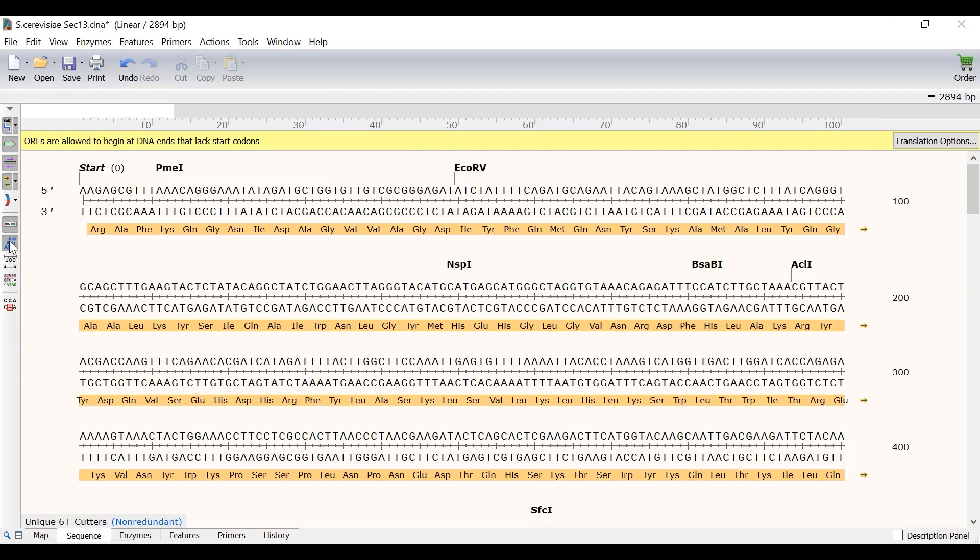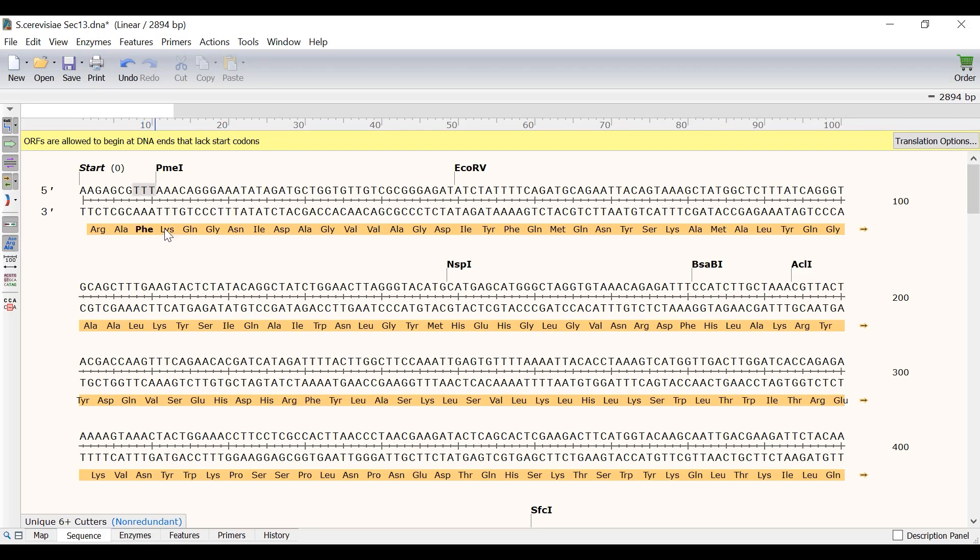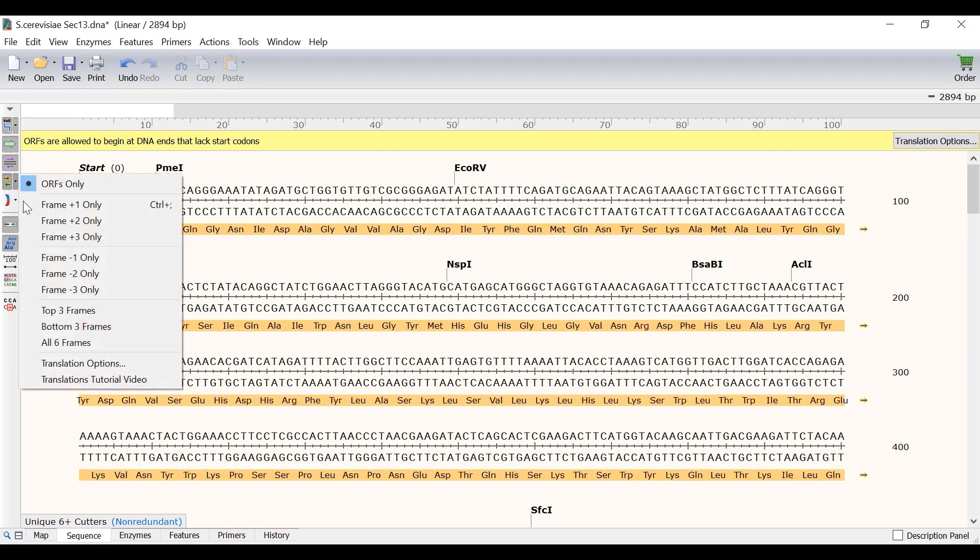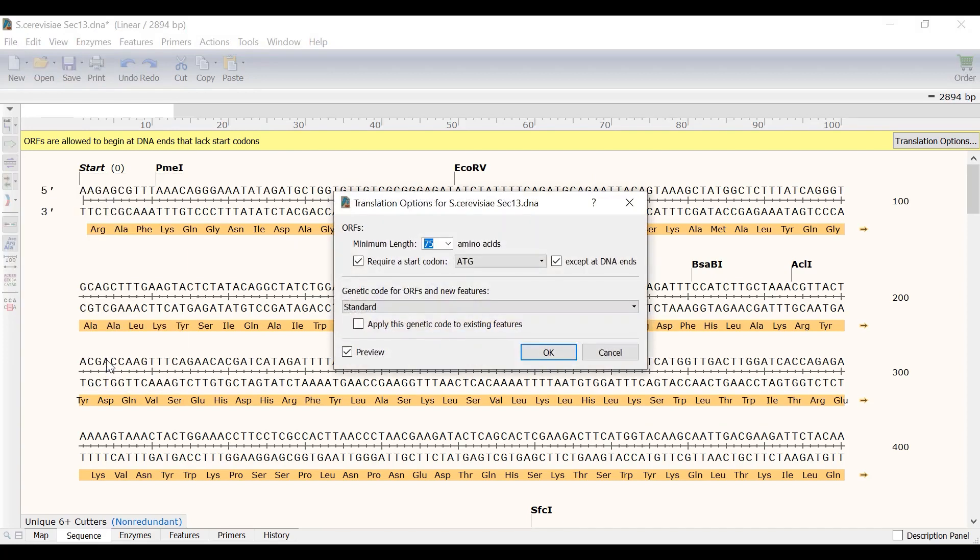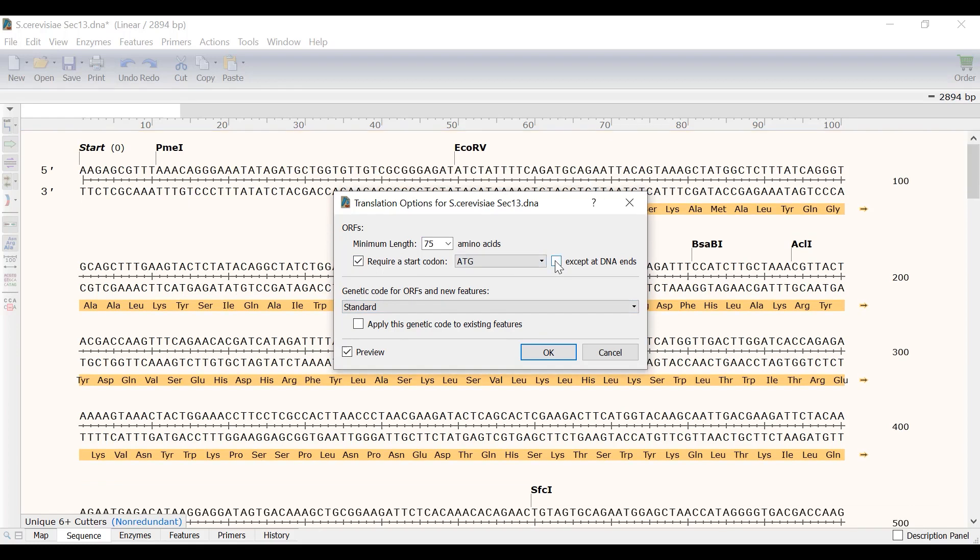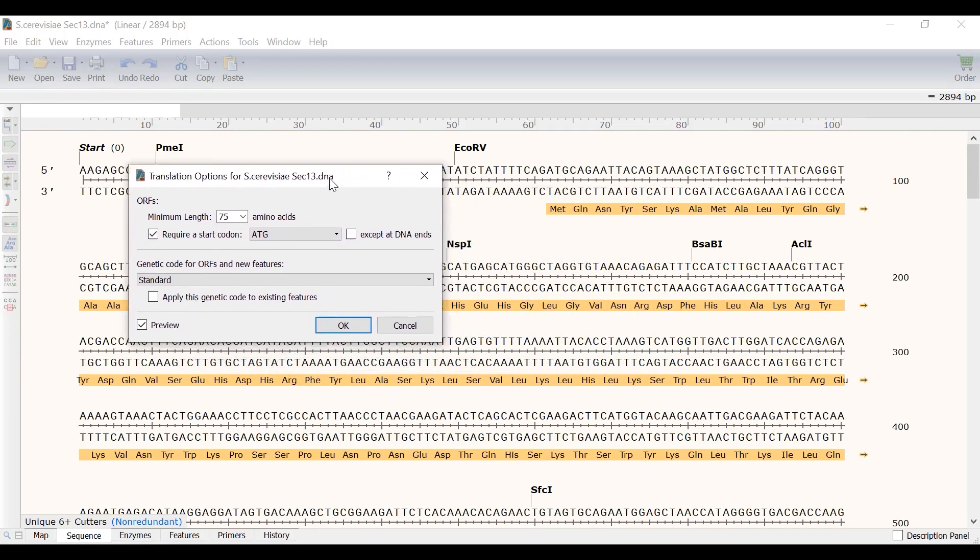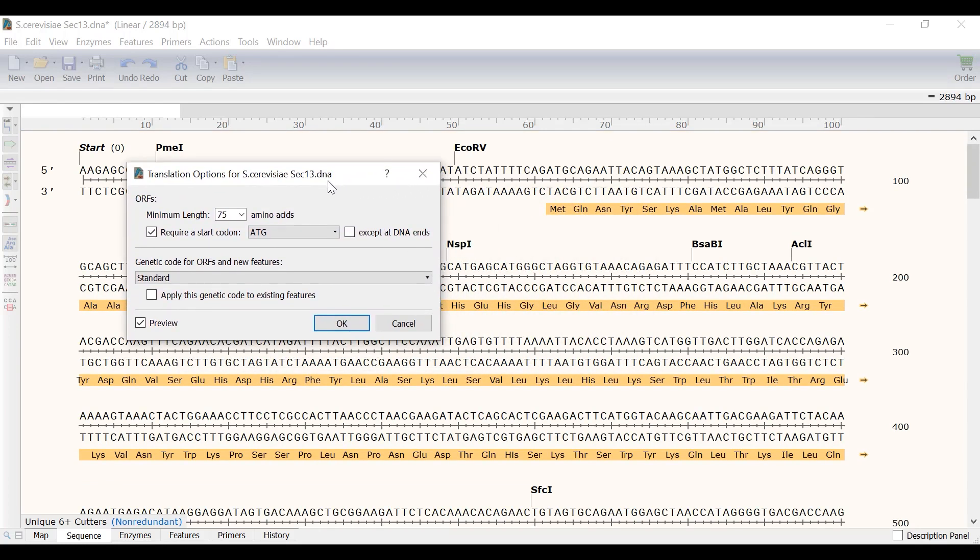Looking at the first top strand open reading frame you will notice that it does not contain a start codon. As indicated in the message in the yellow bar at the top, Snapgene's default behavior is to allow open reading frames to begin at DNA ends. To change the translation settings I can select the translation options button in the yellow bar or click on the arrow next to the show translations button and select translation options. In the new window I can uncheck the option to require a start codon except at DNA ends. Now the open reading frame will be forced to start at the first AUG methionine codon as shown here.